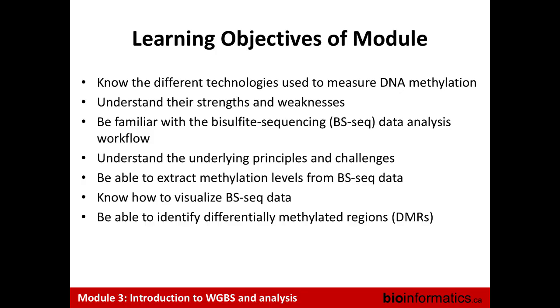The objectives of the module are to go over the different technologies used to measure DNA methylation, have a sense of the strengths and weaknesses, and then the workflow that we'll go into in more detail, both in the presentation and in the lab, which is bisulfite sequencing data analysis. We'll see some of the challenges. We'll extract methylation levels from this type of data, and then we'll learn how to visualize. And on the DMRs, the differentially methylated regions, this is really just going to be an overview.